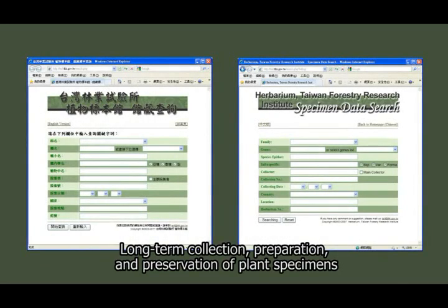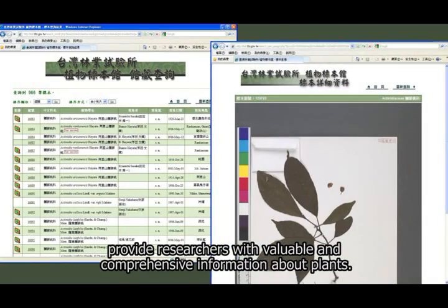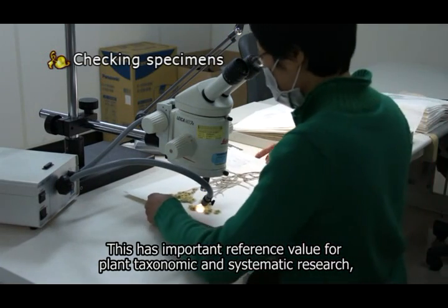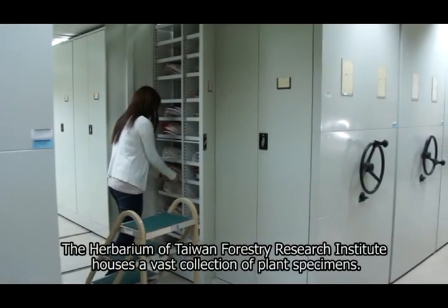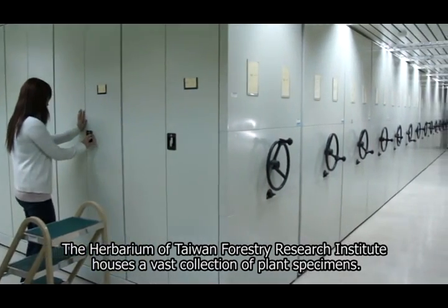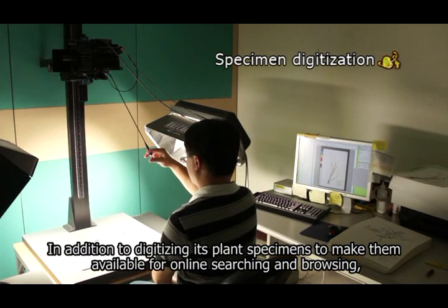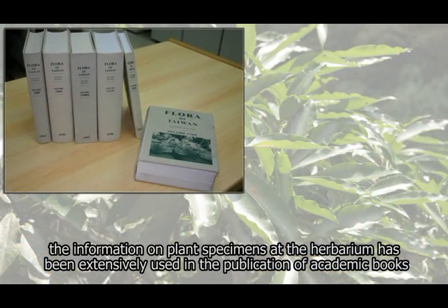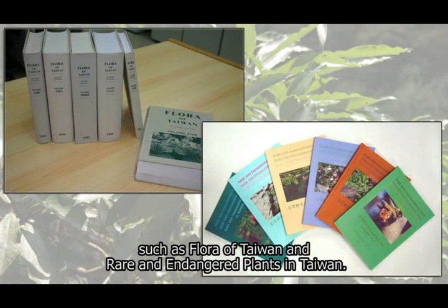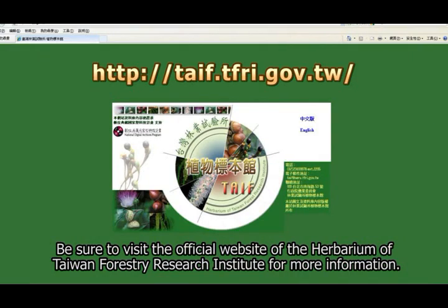Long-term collection, preparation, and preservation of plant specimens provide researchers with valuable and comprehensive information about plants. This has important reference value for plant taxonomic and systematic research, phytogeographical distribution, and assessment of endangered species. The herbarium of Taiwan Forestry Research Institute houses a vast collection of plant specimens. In addition to digitizing its plant specimens for online searching and browsing, the information has been extensively used in publications such as Flora of Taiwan and Rare and Endangered Plants in Taiwan. Be sure to visit the official website of the Herbarium of Taiwan Forestry Research Institute for more information.